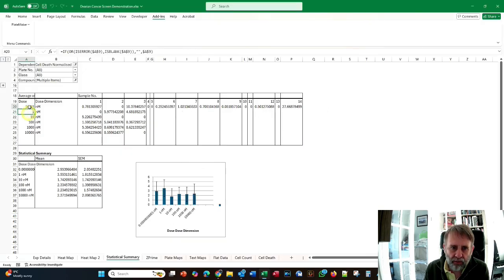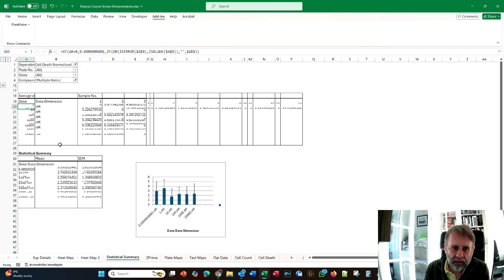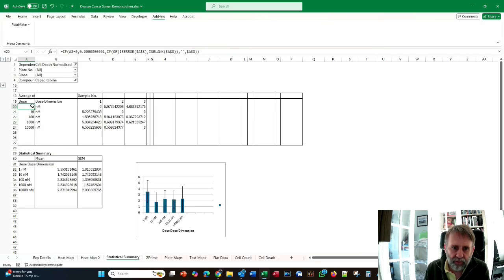And you can see that now it reads 1 times 10 to the minus 10, which is exactly what I want. Notice that if it doesn't equal 0, if I release the DMSO, which I can do here, then it'll go back to 1 because obviously that's correct. Okay, so we've got exactly what we need now.